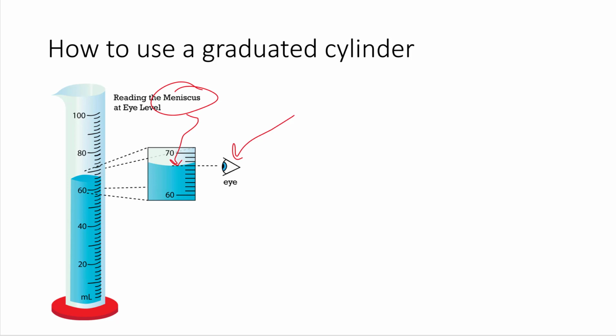The liquid attaches itself to the side of the container, since most of the things that we use in class are water based. The liquids are water-based, or the solutions are water-based. They're dissolved in water. They have an attraction, an adhesion to the surface of the container, either plastic or glass. And so that causes it to curve up on the sides. So you don't measure on the sides, not there, right?